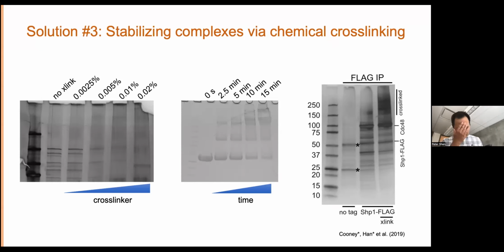So another important note, thanks for the question. We do all of our IPs, our purification, in a HEPES-based buffer, because if we were to do it in Tris, then Tris with all of its primary amines would make that sample inaccessible to glutaraldehyde-based cross-linking. So we do our purifications in HEPES, and then if we cross-link, we cross-link in glutaraldehyde and quench in Tris.